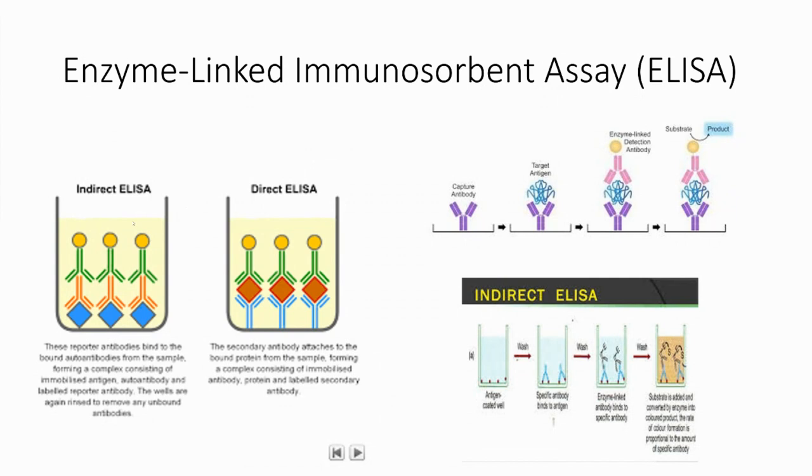Ali. I do have a question. So is the substrate already attached to the antibody that's already attached to, which then attaches to the... You mean the substrate, the green one here? Yeah, the yellow attached to the green one. So that's already attached when you introduce it to the well? This one, you mean the bottom one here? Yes, sorry, that's what I mean.